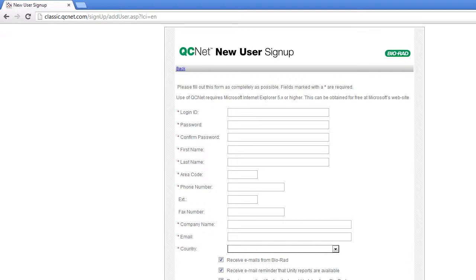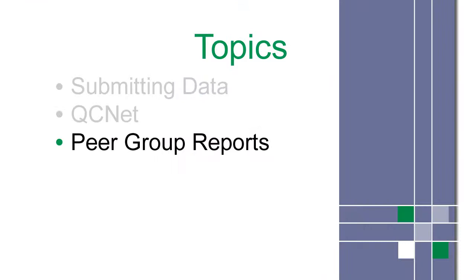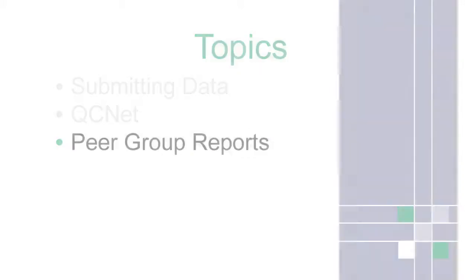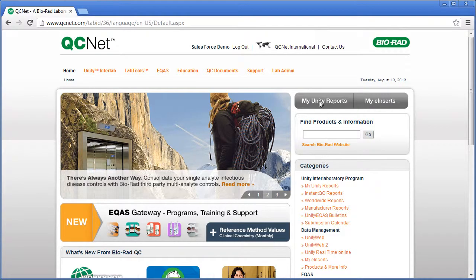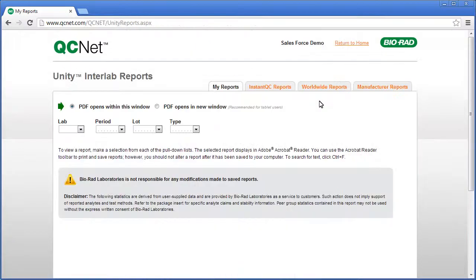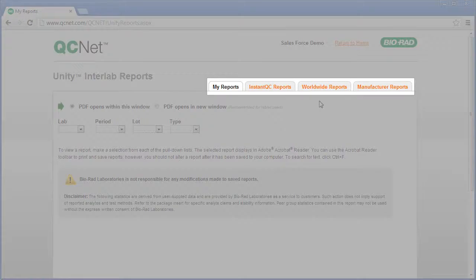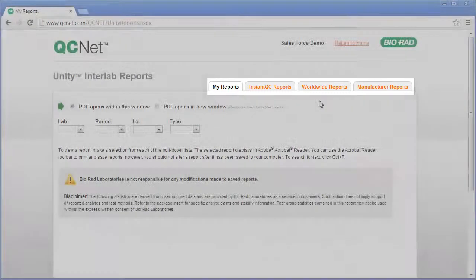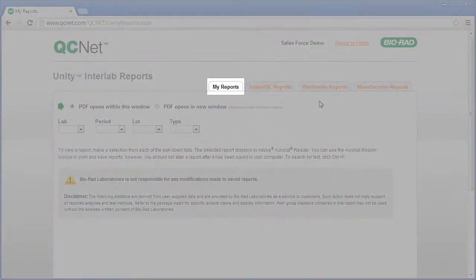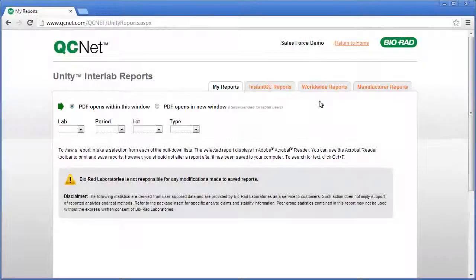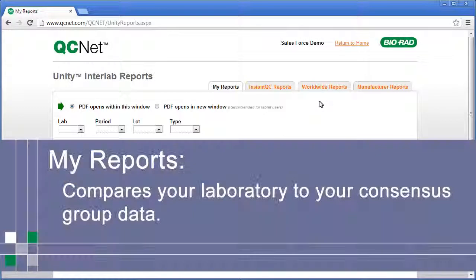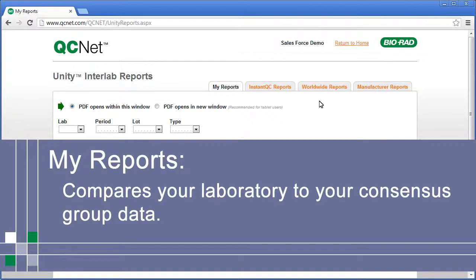After purchasing the software, Bio-Rad associates your primary user with a lab number, which allows them to assign access. Now that we are logged on, let's access peer group reports. Click My Unity Reports. This is the My Reports page. Bio-Rad is constantly improving QCNet, so you may notice improvements to this page.